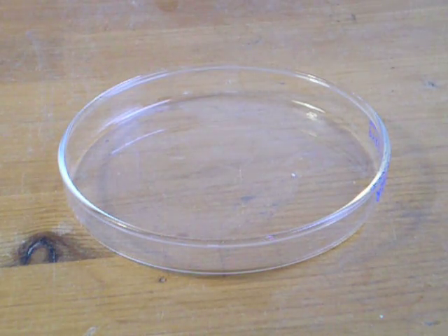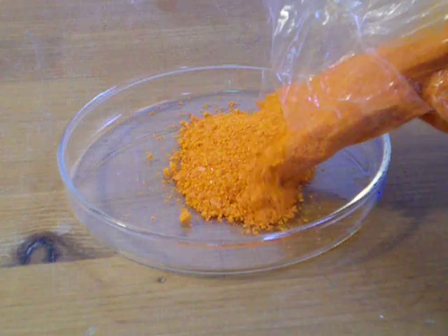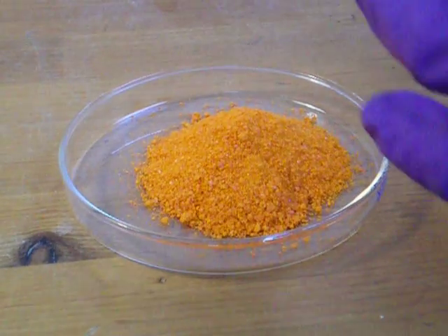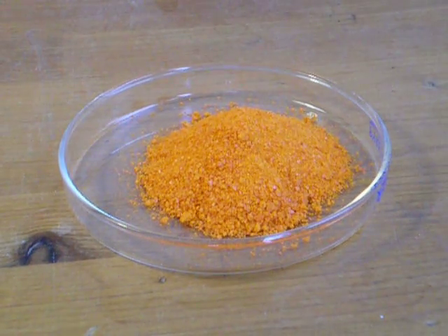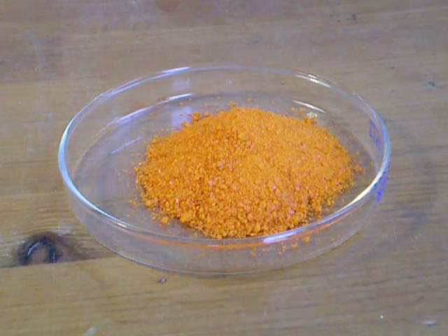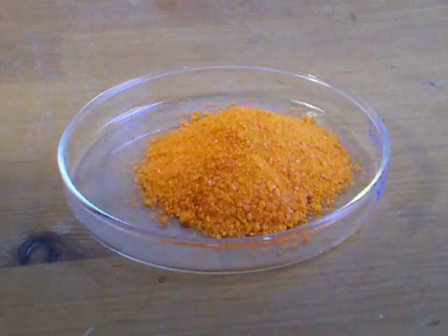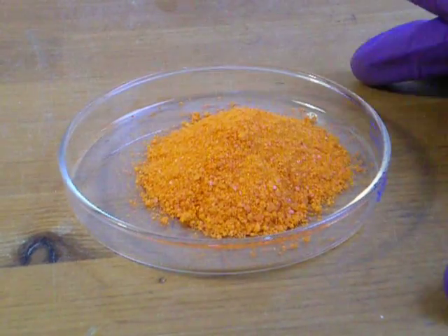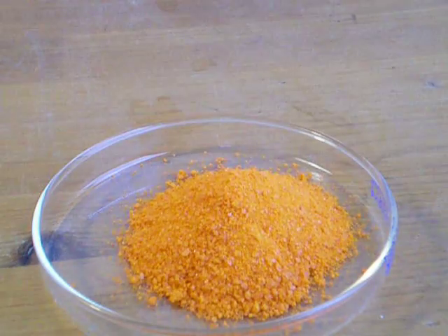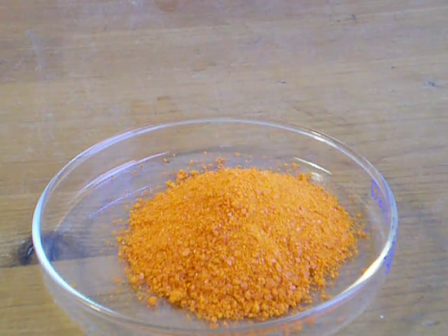So, I'm going to take the ammonium dichromate and I'm going to pour it in. With this, you have to use a match or something. I don't have any matches on me, so I'm going to use the low setting on my blowtorch, because it will just blow it all over. So, just make a little pile, basically. And what's going to happen is it's going to spark and make a lot of ash.